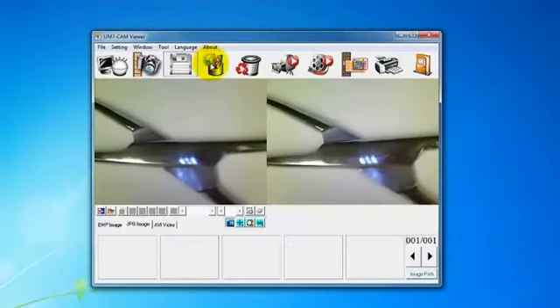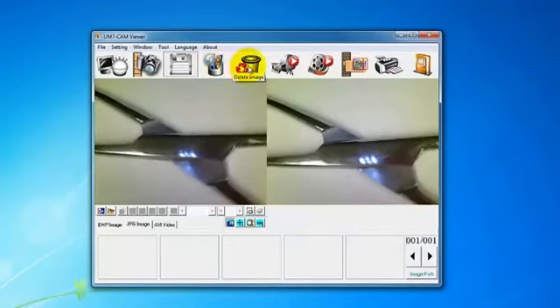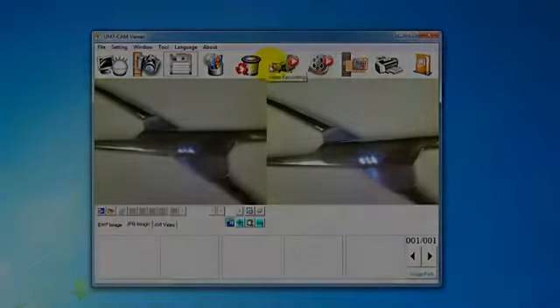This next icon is for the Edit Image functions. Click on the button to enter several options of tools to edit pictures. This is the Delete Image icon. When selected, this will delete the image.